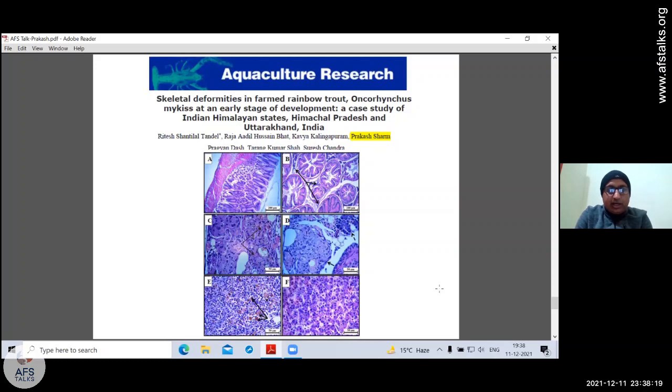So this is another work here. I'm showing the case study of how rainbow trout is affected in some of the farms, how this pathological condition was seen.